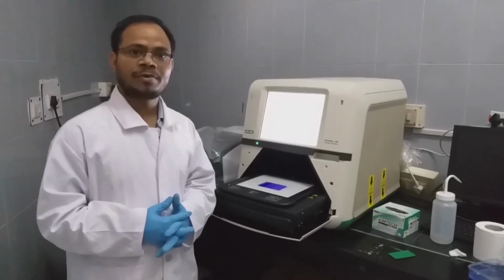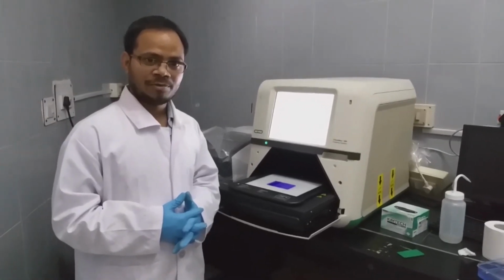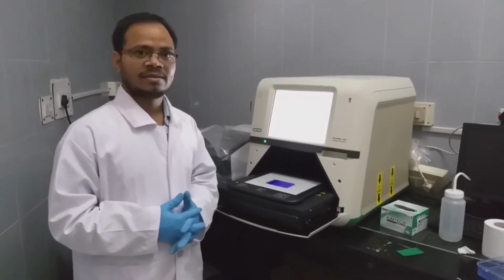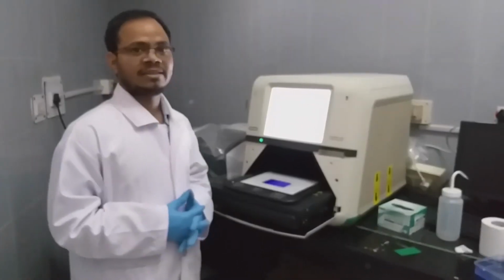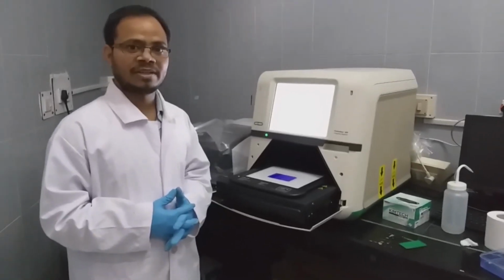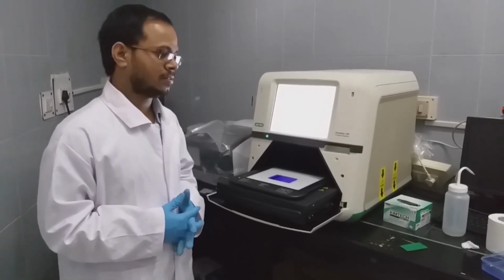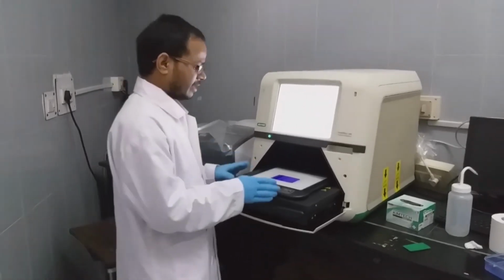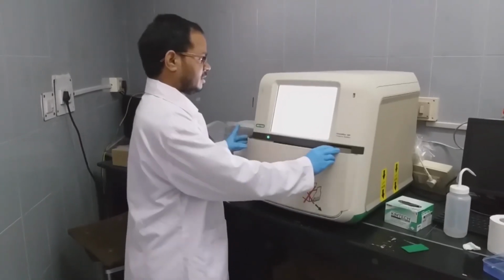So we purified the protein using a nickel NTA column. We ran the gel and stained and destained it. So now it's time to document the gel. We have to identify whether we got any single band fraction or not. This is the gel I kept on a white tray. Now just close it.